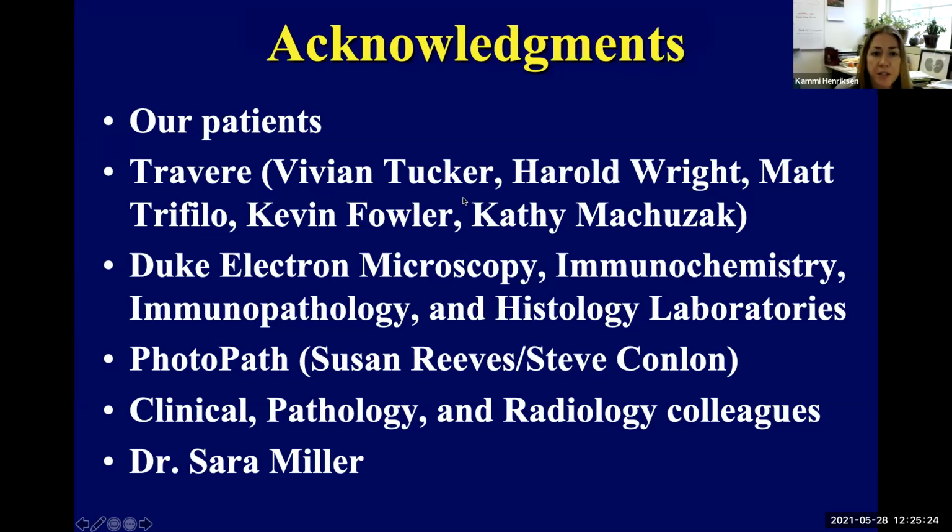And do you have any experience with snap freezing for immunofluorescence with liquid nitrogen?